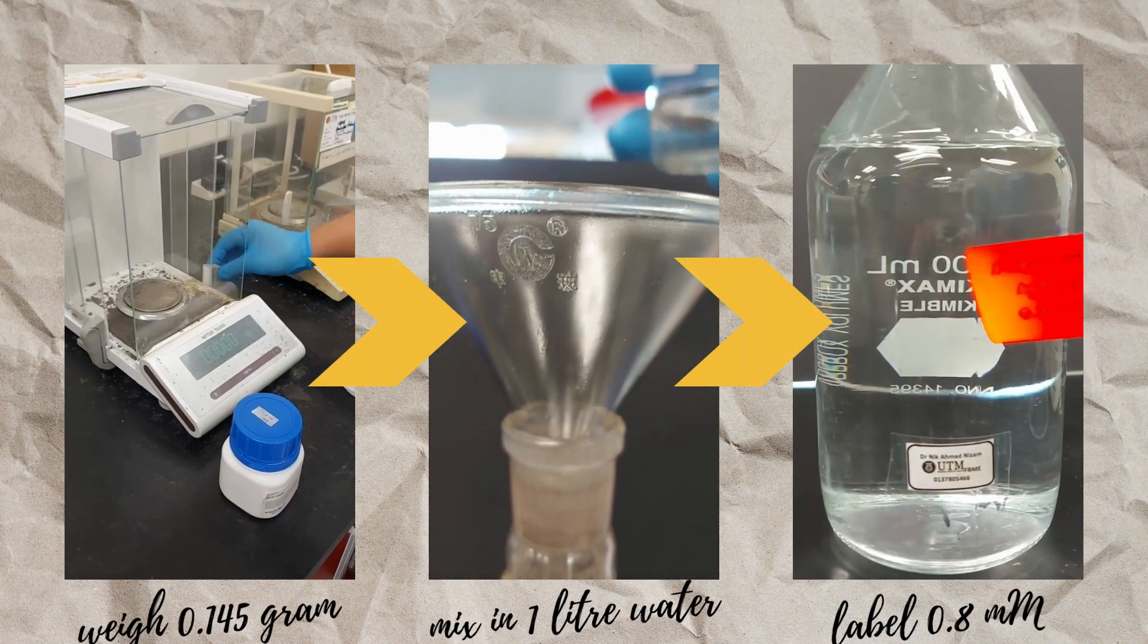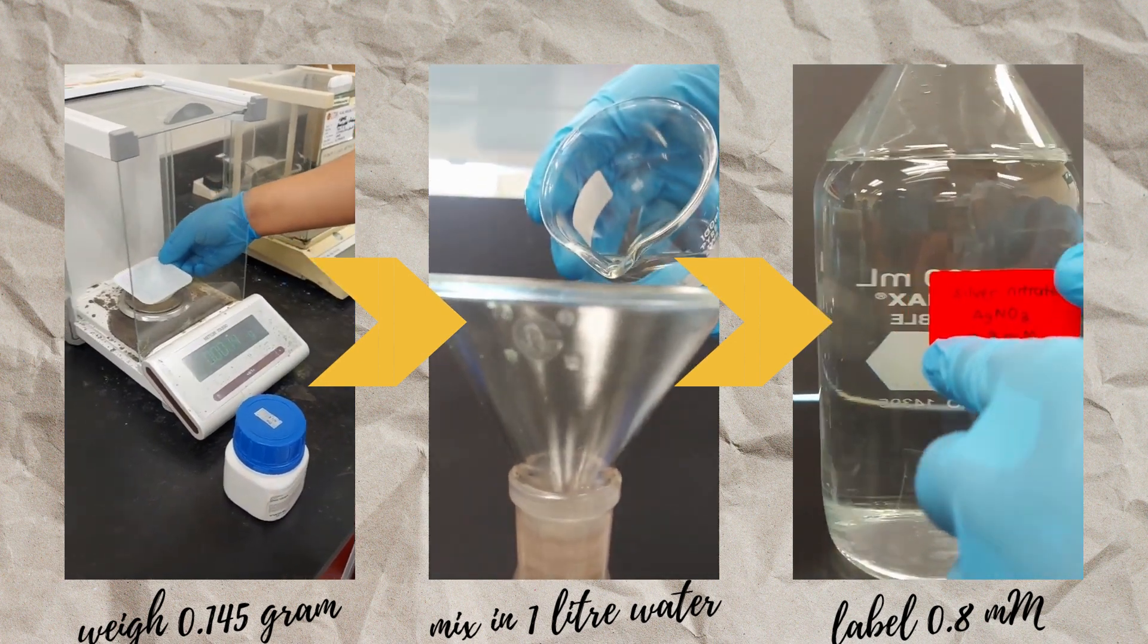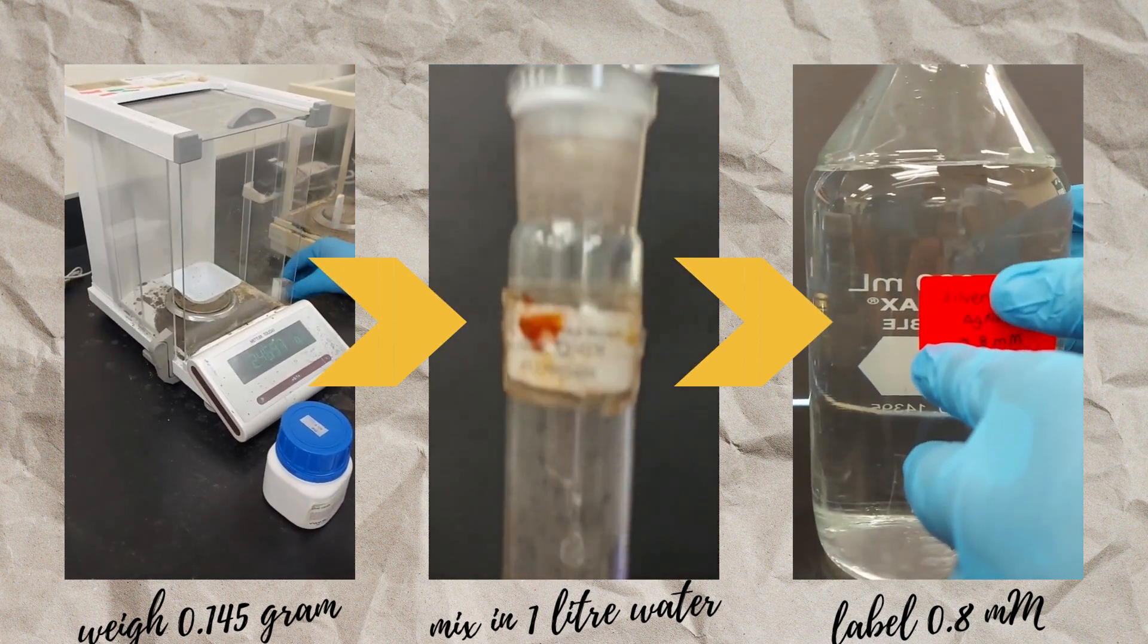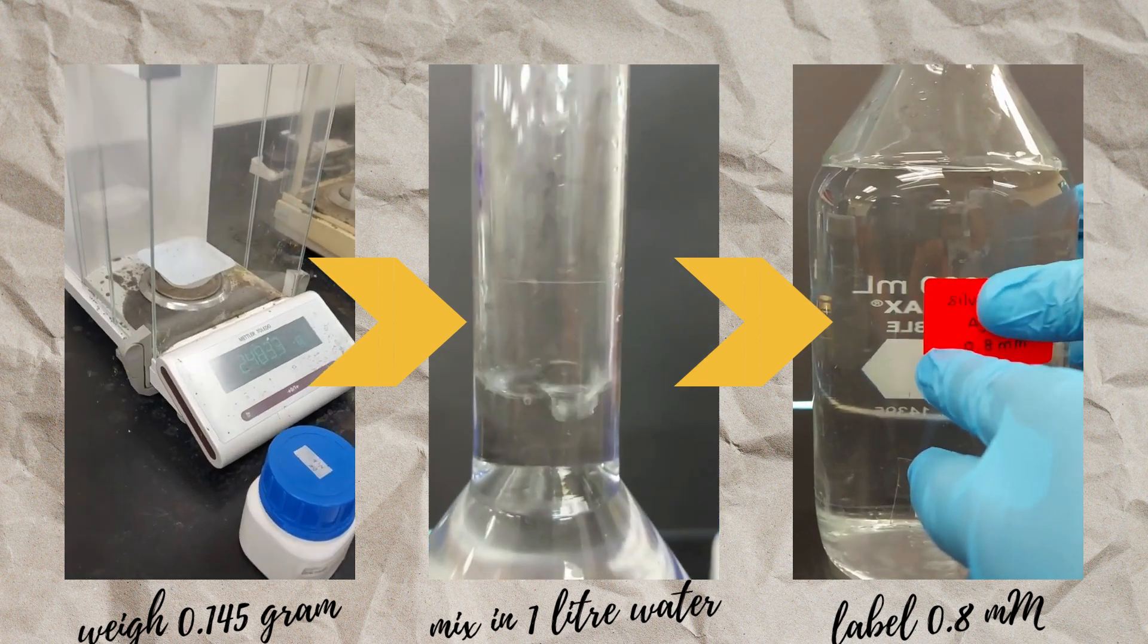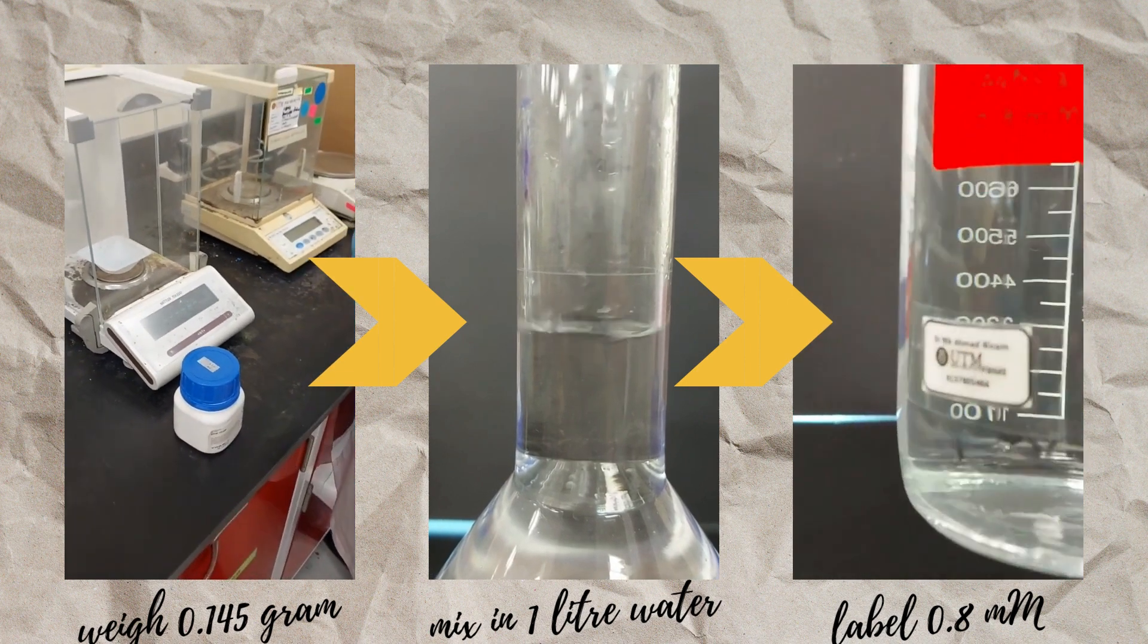Weigh 0.145 gram silver nitrate crystals and add into one liter water and mix them together. The concentration of this solution is equivalent to 0.8 millimolar. Later, don't forget to label the solution.